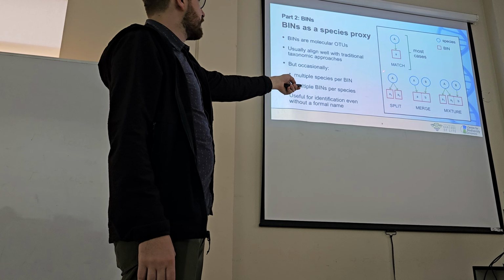So there's a conflict. So you have 500 with one genus, two with another genus. Probably those two have been identified incorrectly, is what you could say, right? So maybe our taxonomists looked at that and gave it the wrong ID, or it could be real biological variation. Those are two different species that have the same barcode. Or contamination as well.